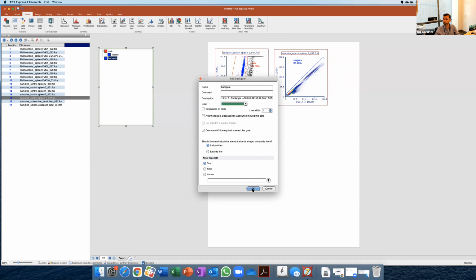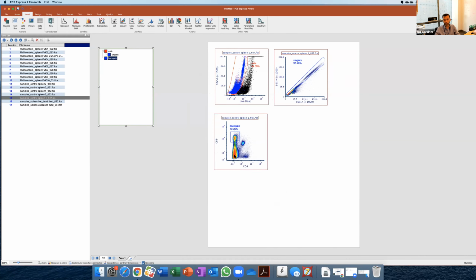I know for some of you this may seem green, for some it may seem blue. There you go. Now we see much better where the green cells fall, and I can update this in real time. We see that these are mostly cells that could be granulocytes or monocytes if you're in doubt, but the lymphocytes are mostly here.